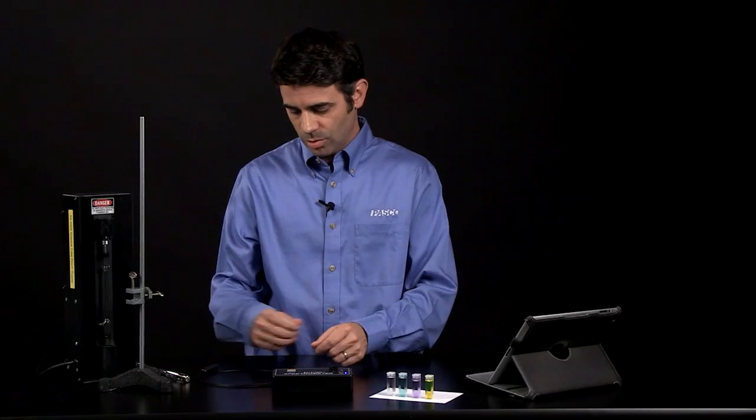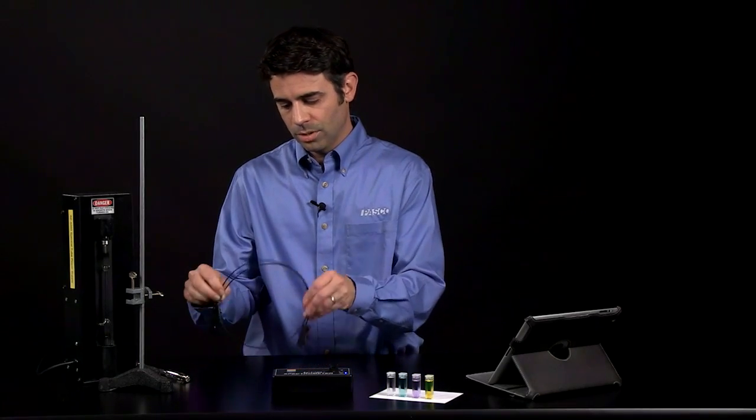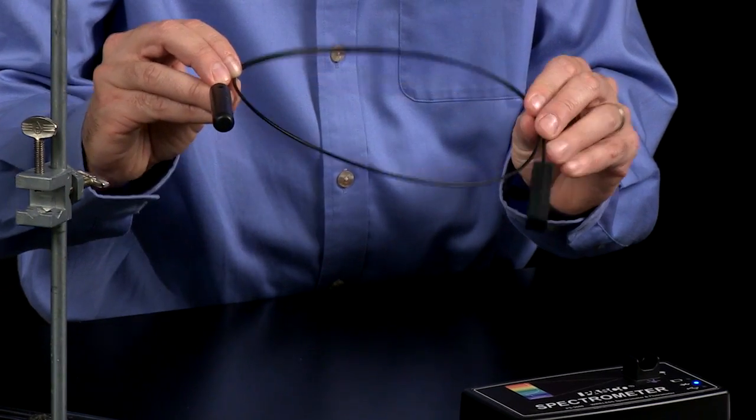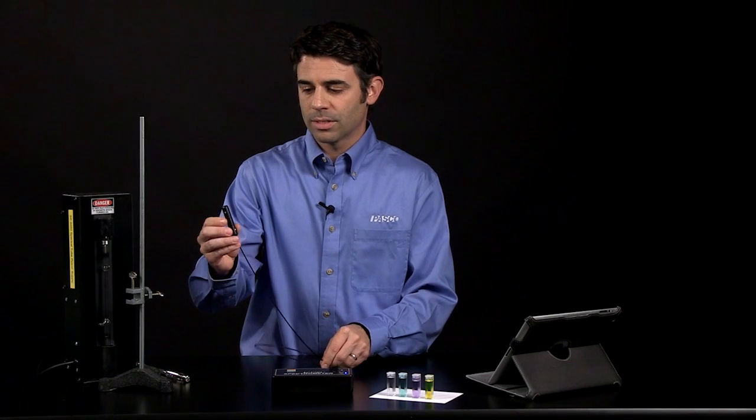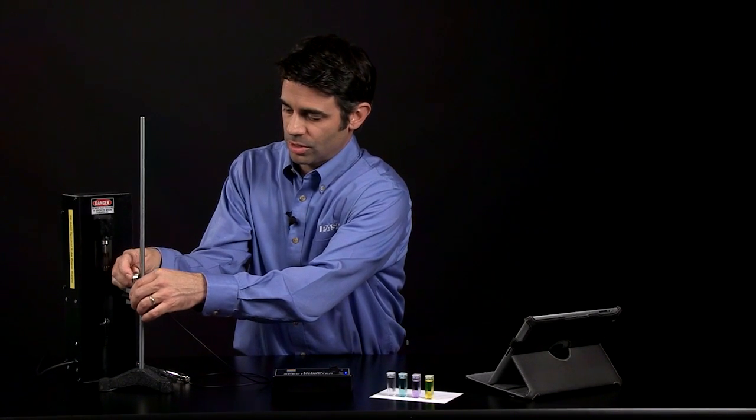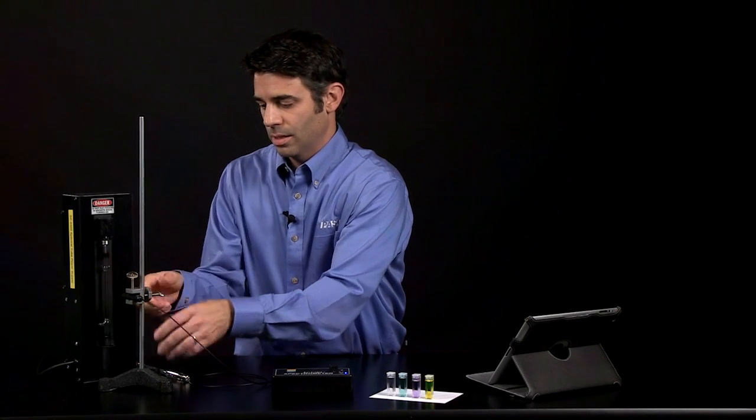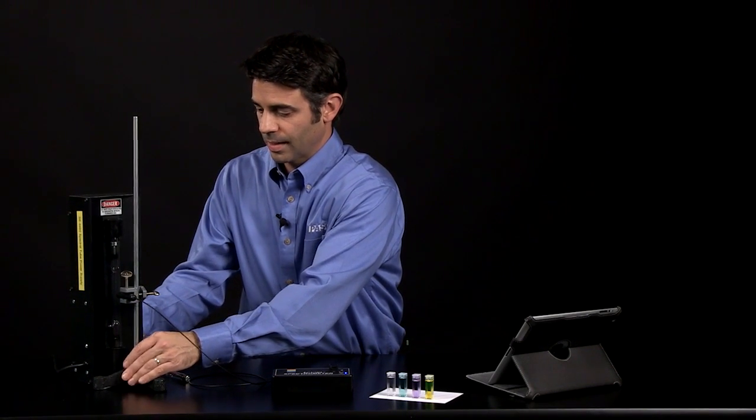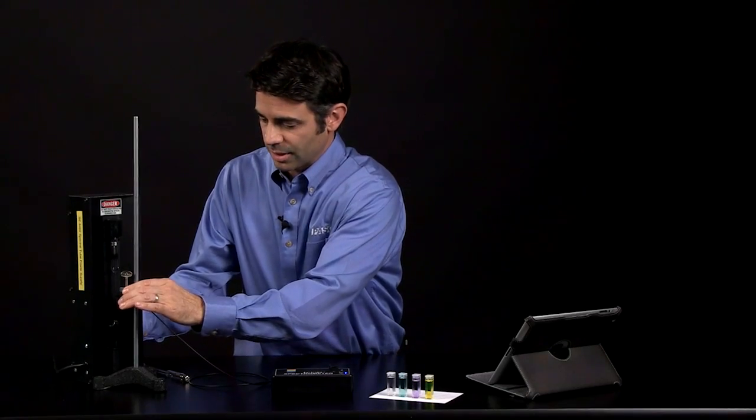To analyze lights, we're going to use the optional fiber optic accessory. One end of the fiber optic accessory, you're going to point at a light source. In this case, I'm going to use some gas emission discharge tubes, and I'm going to use a clamp to hold it steady.